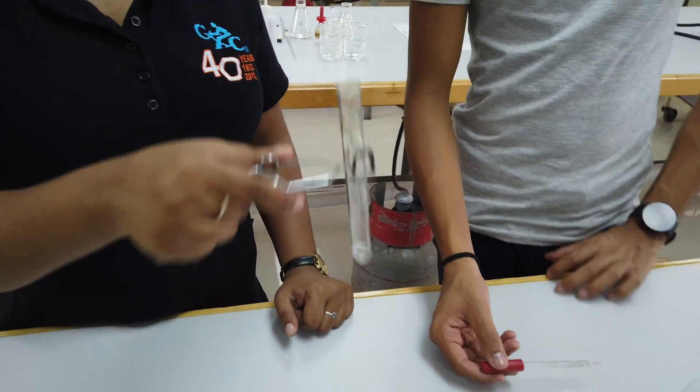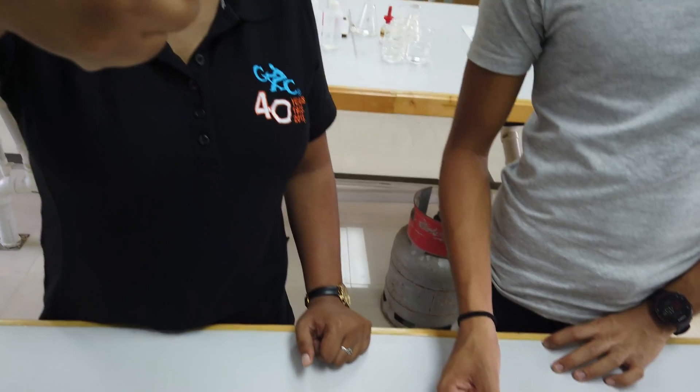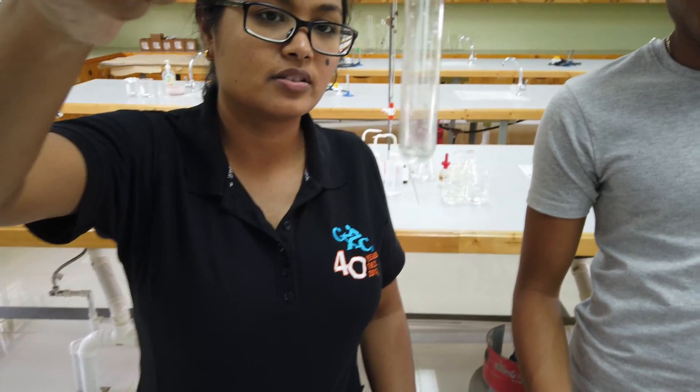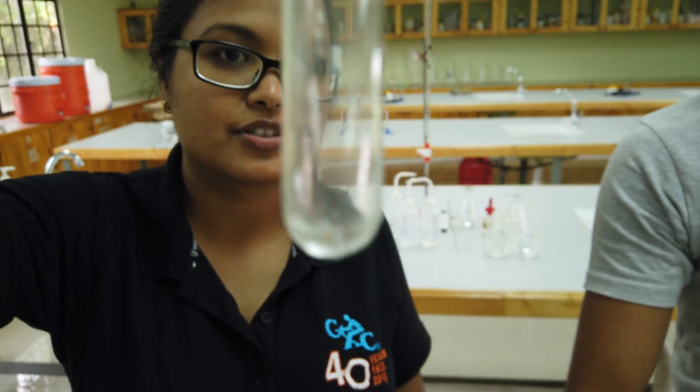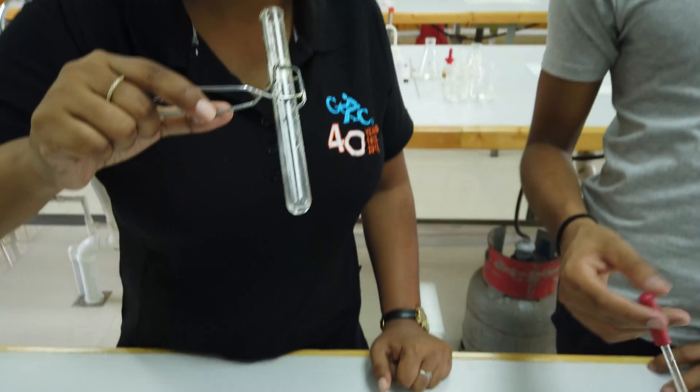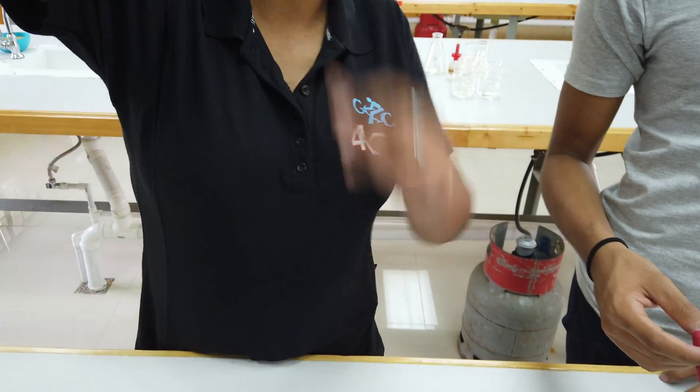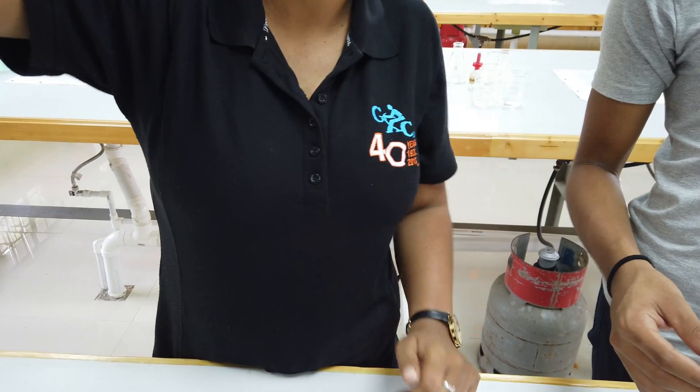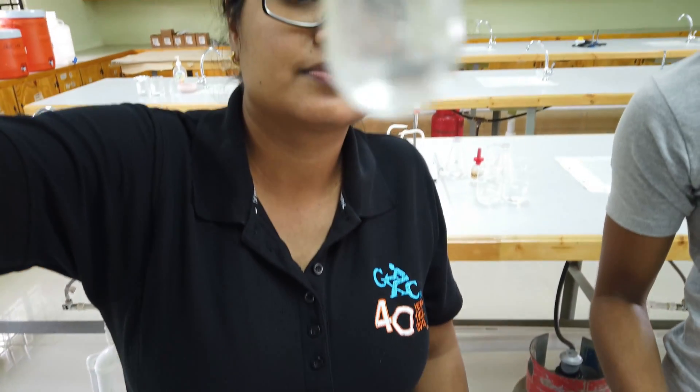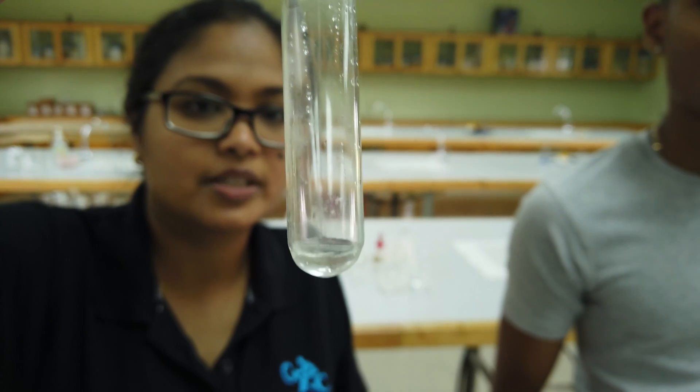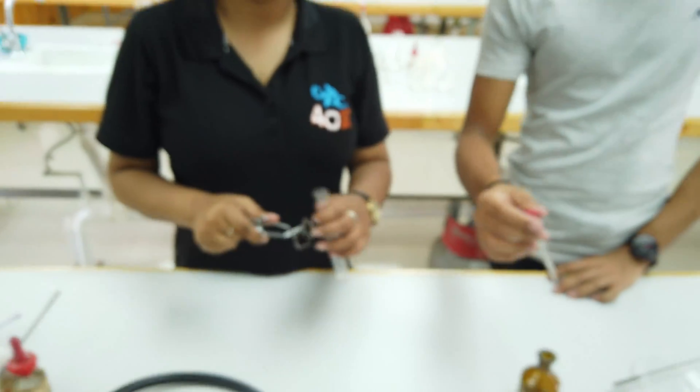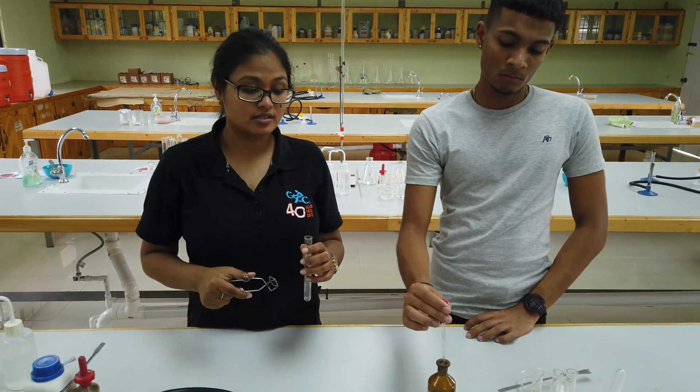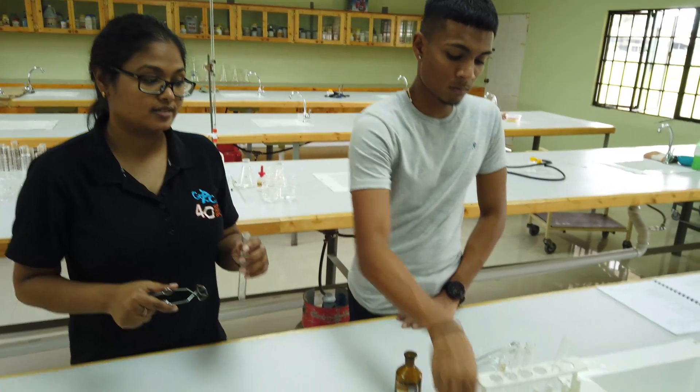See on the bottom of the test tube it's starting to dissolve? Actually almost completely dissolved. So no chloride, bromide, or iodide ions are present. If none of these things are present, then we need to go ahead and test for nitrate.